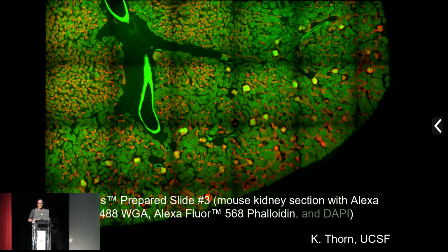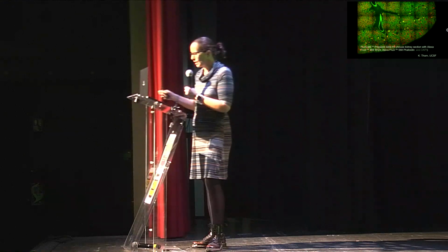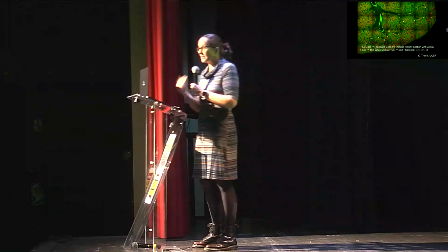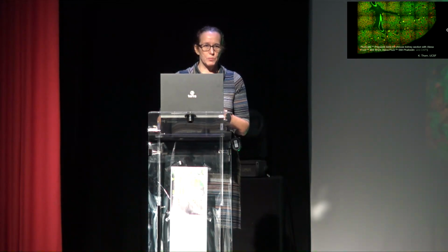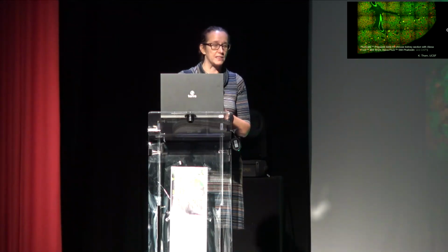These data also obscure one of the main problems in stitching and tiling, which is registration. So from where you sit at your level of display zoom, you can see that, yep, you've got the gross anatomical presentation of data here. But when you digitally zoom in, what you might find is that in 2 dimensions, the individual image panes don't quite register next to each other. And in 3 dimensions, it can be even worse because you've got an extra degree of freedom. So while the image looks quite nice and we can tell what it's meant to be, often when we're putting these through our computational algorithms, the computers are struggling to see what we can see as humans by eye.